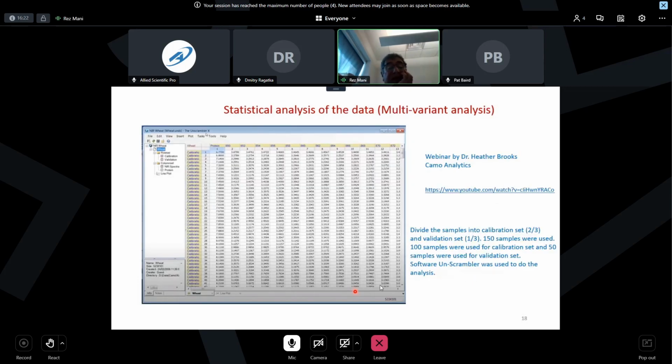Here is a very interesting webinar by Dr. Heather Brooks. We'll send you these links when we send you the recording. I've already given the links to our staff, and he will email them to you. You can watch this. She describes how for wheat, these are some wheat samples, and CAMO Analytics has very important and famous software called Unscrambler that could analyze and do the modeling.